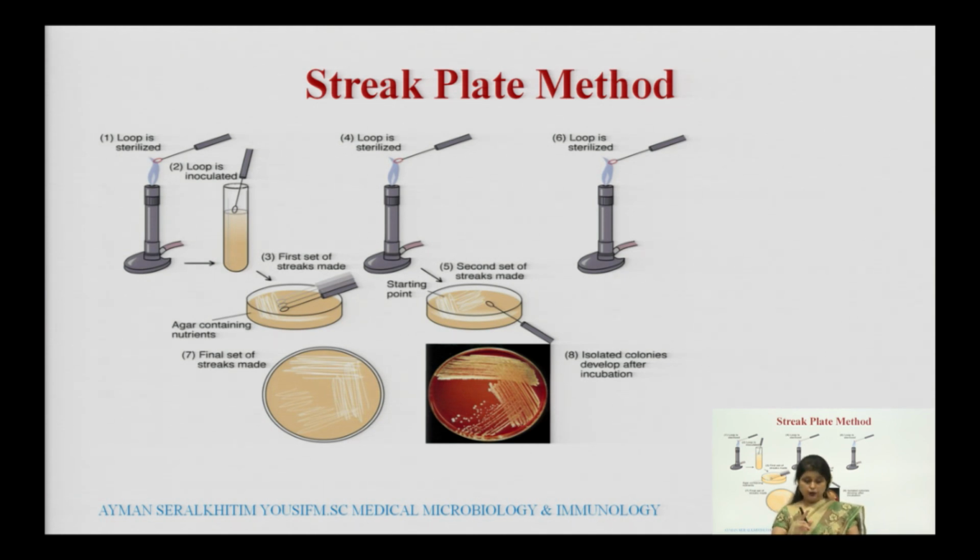The first step, you need to sterilize the glassware. Second step, you need to make the nutrient media, that must be sterile. By autoclaving you have to sterilize that media. After that, you will take that media to the aseptic room, where we can transfer it into Petri plates. In the liquid form we will transfer it into the Petri plates, and in the Petri plates we will get the solid agar medium. Once we keep it at room temperature, the Petri plate containing nutrient agar medium will solidify, and those solid media plates are further used for isolation purposes, for streaking techniques, for spreading methods, for various methods of isolation.